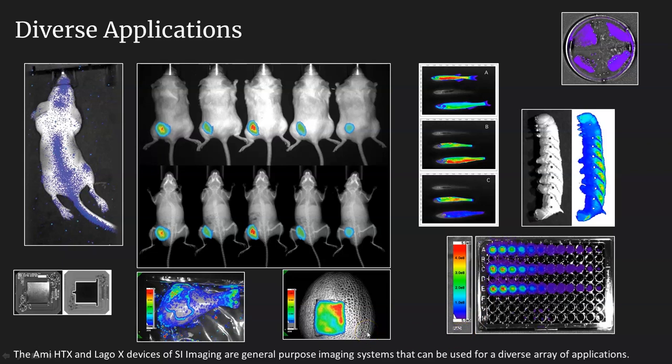Now, there are investigators that are focusing on agrarian questions that will go ahead and make use of in vivo optical imaging as well. And what we're looking at here is the use of optical imaging to evaluate pathogen burden on produce going to market, literally, and the appropriateness of various different techniques to reduce this bacterial load. And be it cantaloupe or chicken wing, the results of this kind of work can be critical in setting up the appropriate treatment of produce in the process of harvesting and handling before it goes to market.